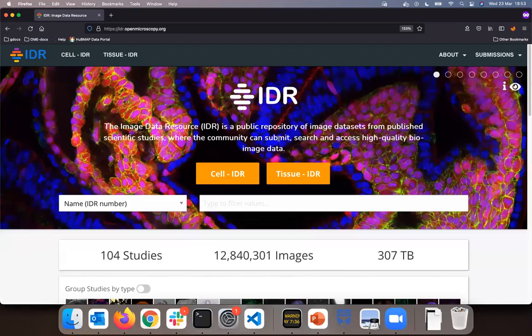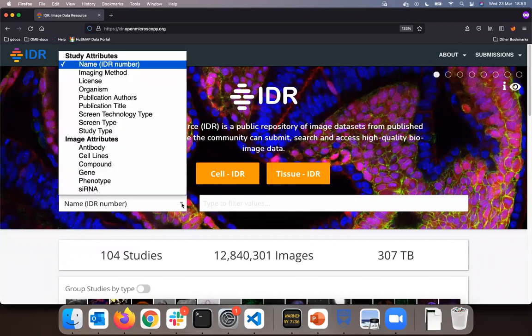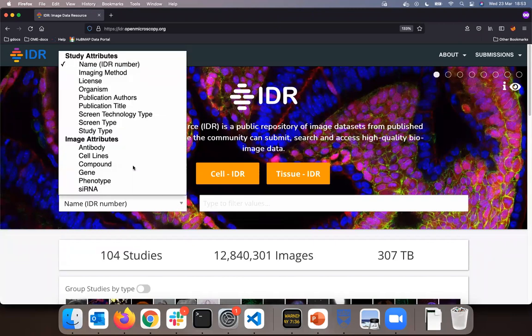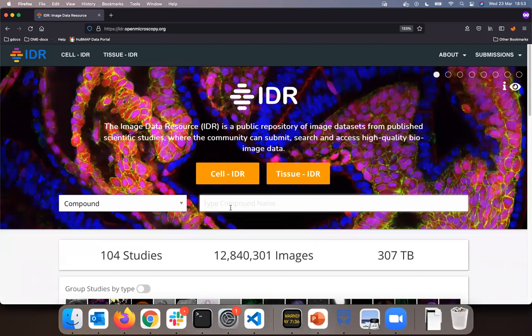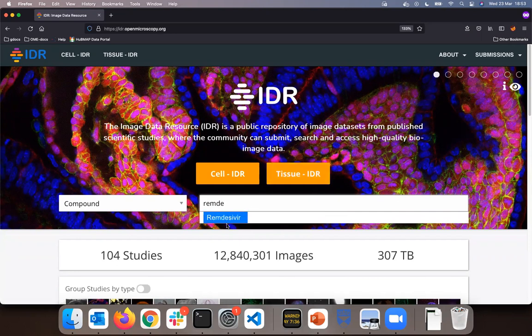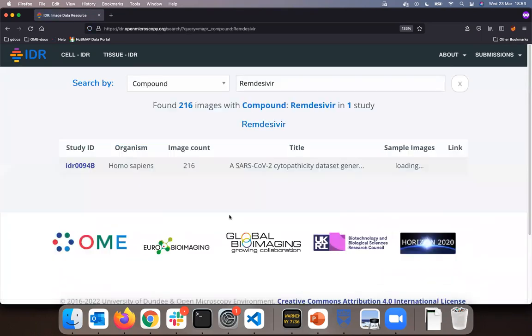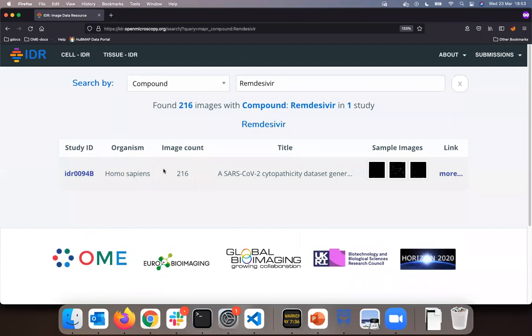Starting at the home page of IDR, I will select search for compound and start typing Remdesivir. I have one autocomplete suggestion. I accept it.